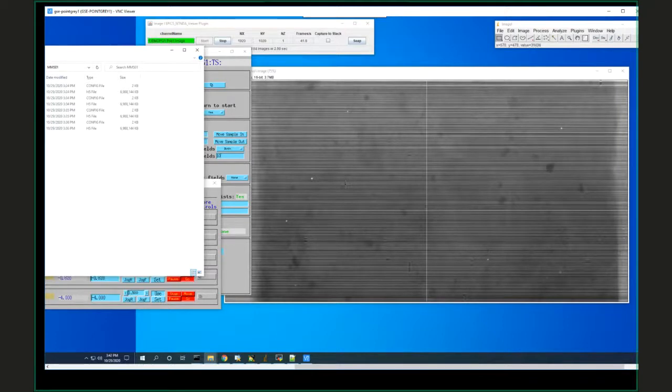Yanbin, this is Yue. Yes, hi. I have a question. It looks like it's not so critical where the rotation center, the rotation axis, is within the sample, right? Mark just roughly aligned 0 degree and 90 degree. As long as you have air on both sides, you should be okay. So air is your reference. As long as you have the air on both sides, and the software can calculate the absolute contrast, then you should be okay. And in fact, sometimes for a sample like this, it's impossible to find the rotation center. Right, that's not critical.